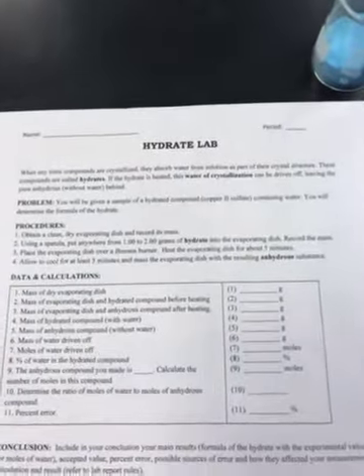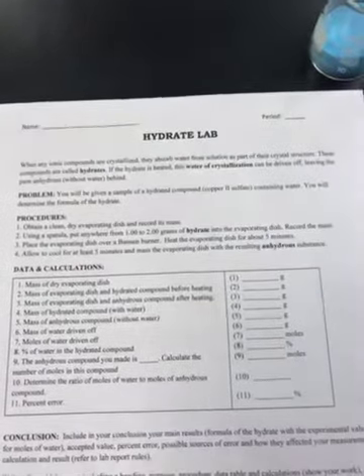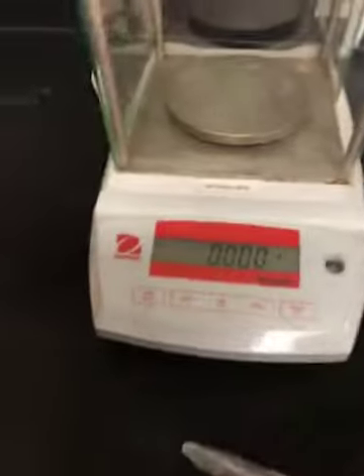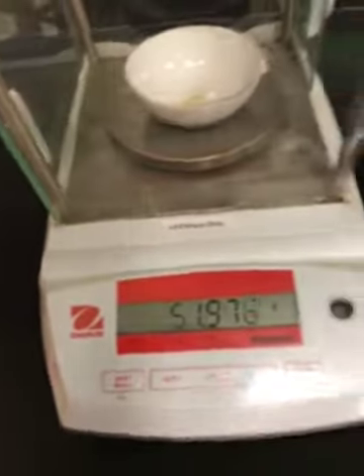So step 2 says, using a spatula, put anywhere between 1 to 2 grams of the hydrate into the evaporating dish and record its mass. So we're going to take our evaporating dish again, and we're going to add some of that copper sulfate.